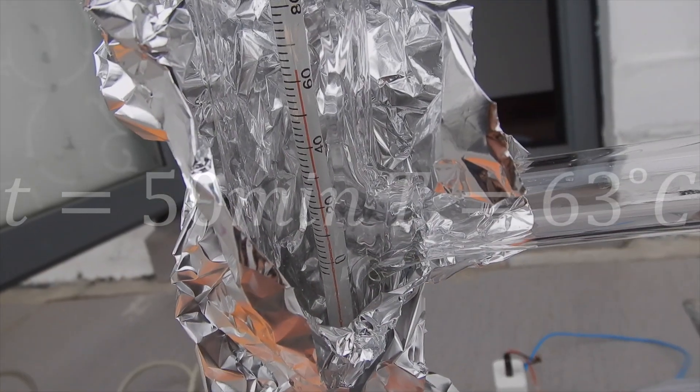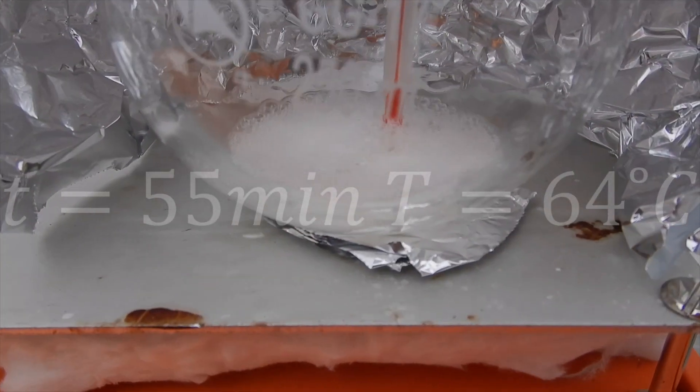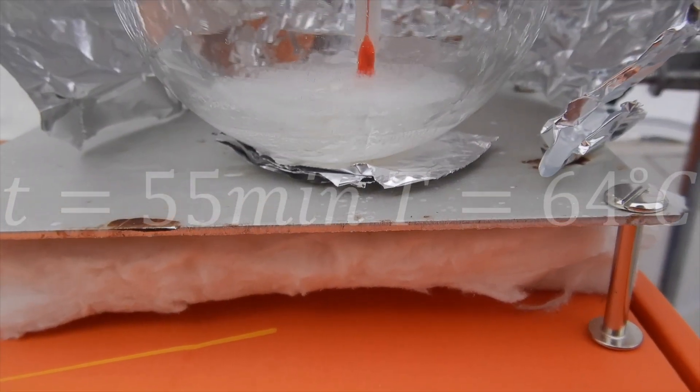The temperature continues to increase to 63 degrees Celsius, and the drip rate lowered to about 1 drop per 2 seconds. Not long after, nearly all the liquid in the flask boiled off.